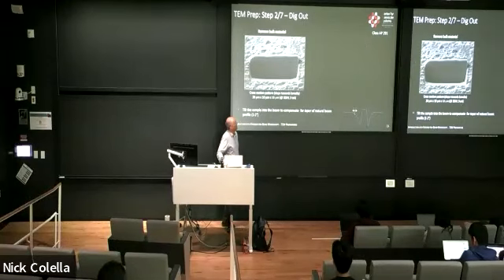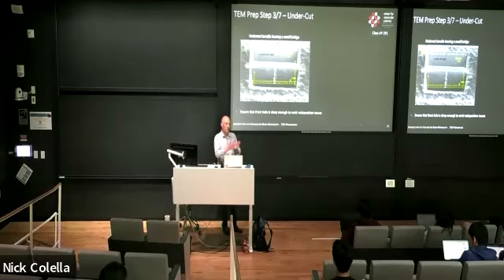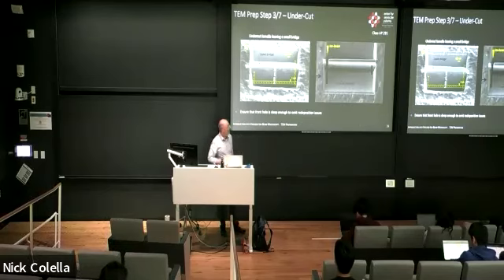Then we start with the ion beam to cut trenches in the front and in the end, and we then trim these, where we have a rectangle standing in the middle that we then trim down to a certain thickness. Then we are using the ion beam and cut a J-shaped form into the structure, so that we have basically a cantilever left over that is just barely hanging on a small bridge.